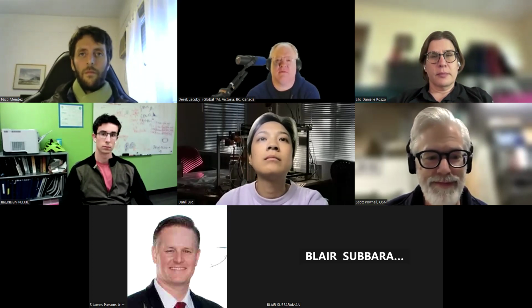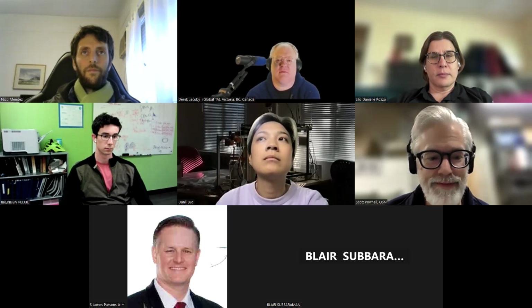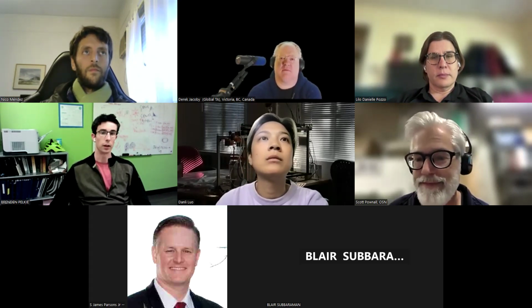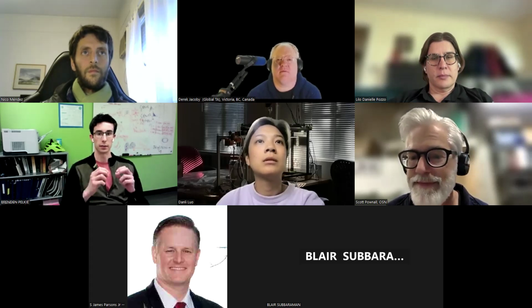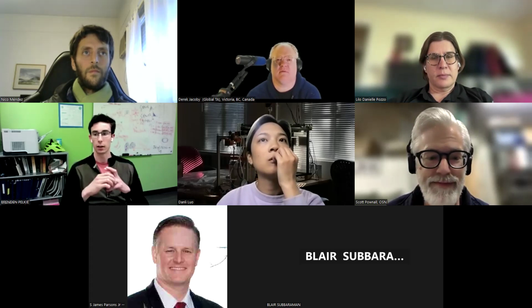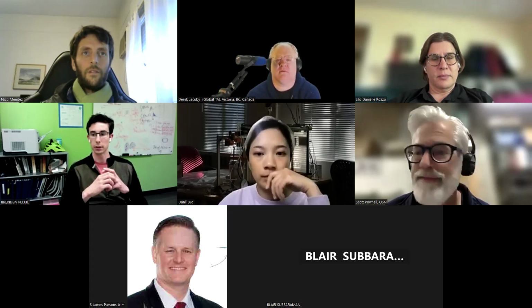Brendan, I saw earlier you put a McMaster X profile ring into the chat. Do you want to speak to that for a second? Sure. I was thinking about, Nico, I think we're talking about pipetting fast and maybe having O-ring issues. You were alluding to that. Maybe this is another option.